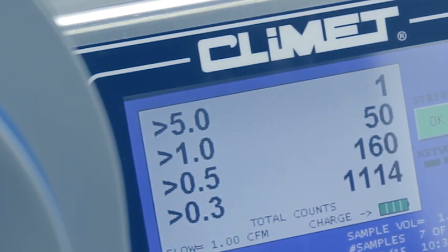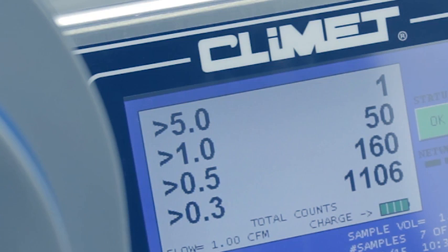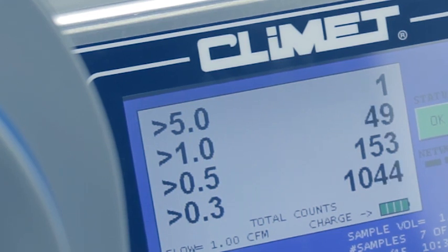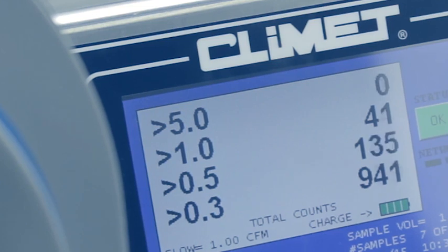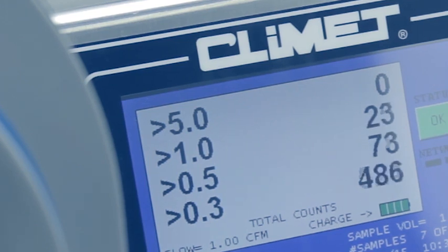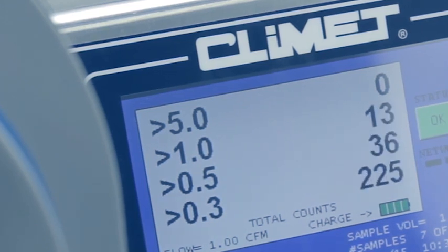You can see by the counter that on entering the workstation, particulate is introduced. However, if you keep an eye on the counter, the HEPA filter starts to work immediately, and don't forget that all the atmosphere is recirculated and passes through the filter continuously hundreds of times an hour. You can see that the particulate count is soon reduced to 0.